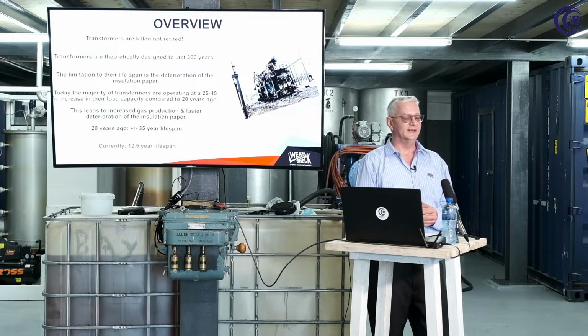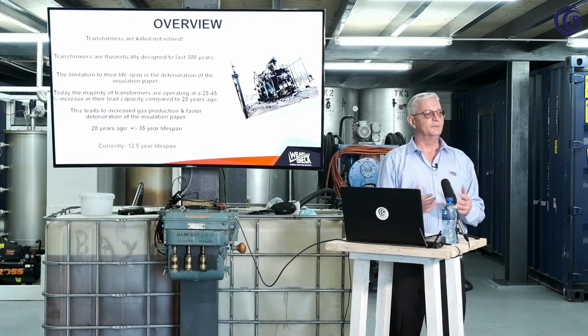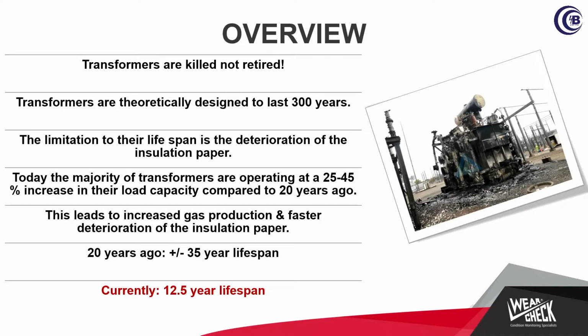Unfortunately, we are living in a country where preventive maintenance is not done regularly on transformers. It's almost in some cases a swear word and money is spent elsewhere. So what is happening is that people are leaving the transformers up to the point where they fail. And in 95% of cases, the laboratory can predict any fault developing in a transformer months, literally months, prior to that fault actually happening. For that, we need test results. We can't guess it. We need to have a sample, we test, and we make a recommendation to the clients.